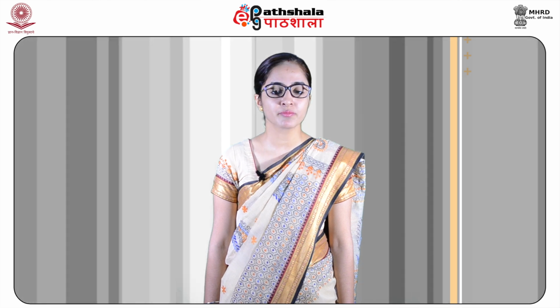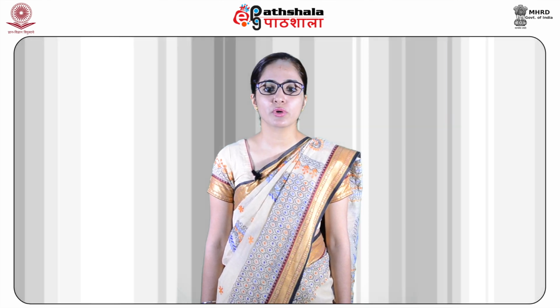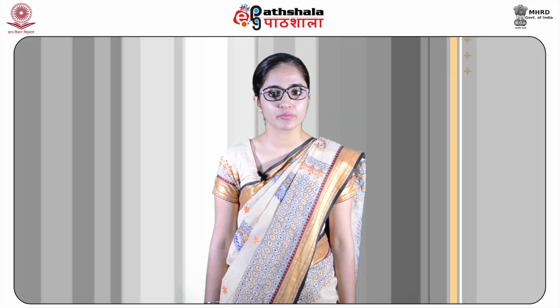There are various types of 2D NMR experiments such as correlation spectroscopy, short form COSY, heteronuclear correlation spectroscopy, HETCOR, exclusive correlation spectroscopy, eCOSY, total correlation spectroscopy, TOCSY, incredible natural abundance double quantum transfer experiment, INADEQUATE, heteronuclear single quantum correlation spectroscopy, HSQC, heteronuclear multiple bond correlation spectroscopy, HMBC, nuclear Overhauser effect spectroscopy, NOESY, rotating frame Overhauser effect spectroscopy, ROESY.